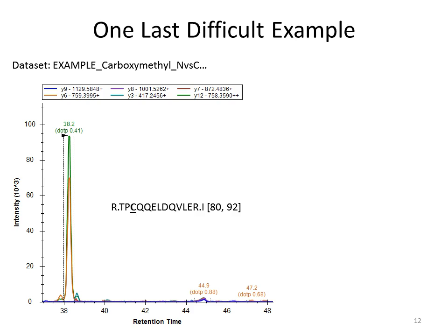I had a couple questions from students. So not all of the peptides in this target list are going to be able to have a dot product, because you have to have a spectra in your spectral library for that peptide to calculate dot product at all. So you've got to check.